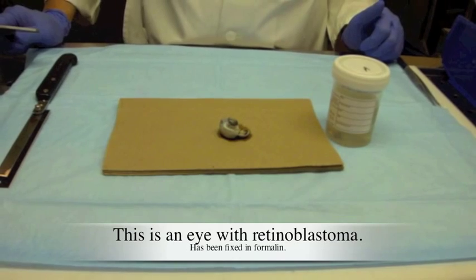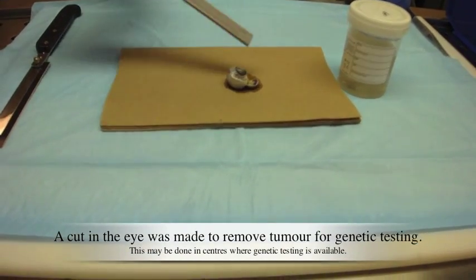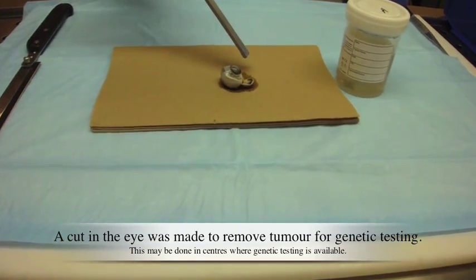This is an eye with retinoblastoma. A cut in the eye was made to remove tumor for genetic testing.